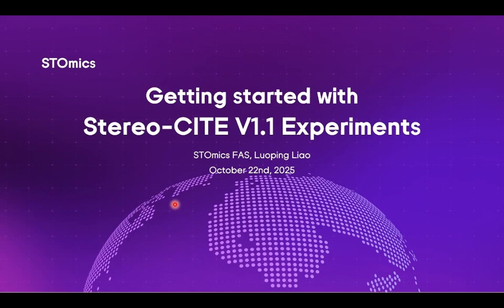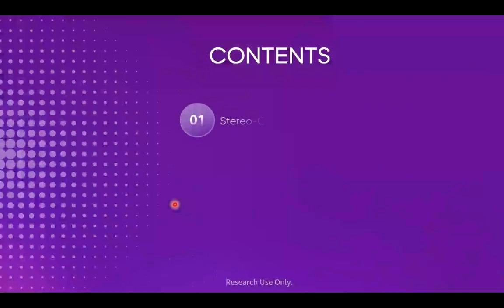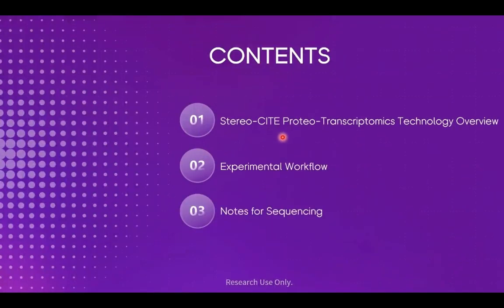Today I'm going to present getting started with Stereo-CITE version 1.1 experiments. In my section, it covers 3 main parts, including how Stereo-CITE works, the experimental workflow, and keynotes for sequencing. Ready to dive in? Let's get started.